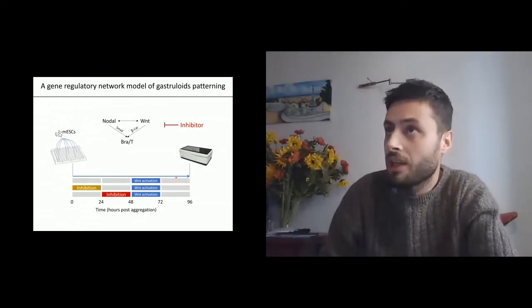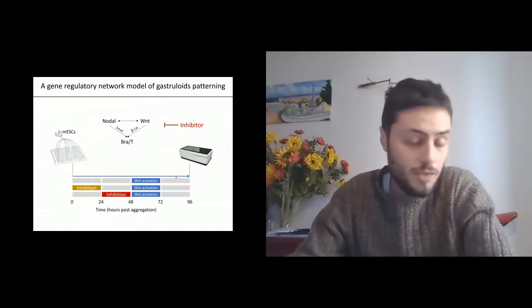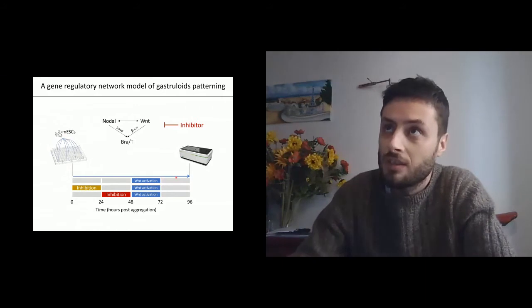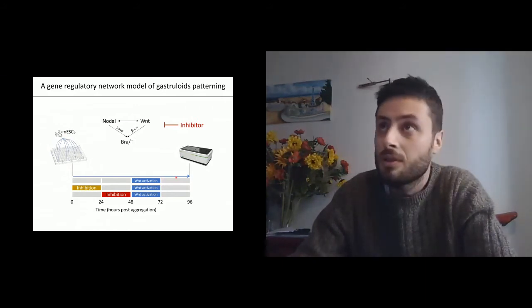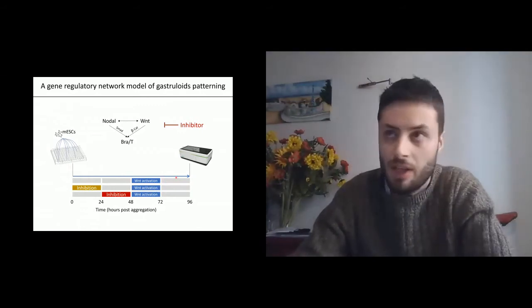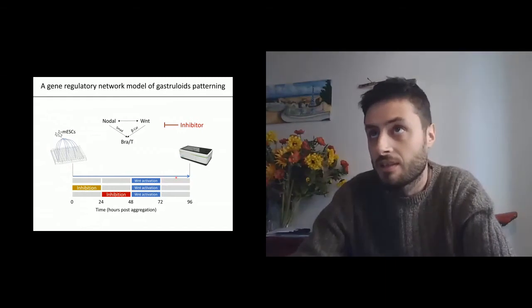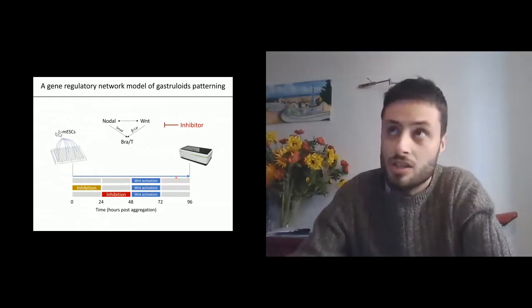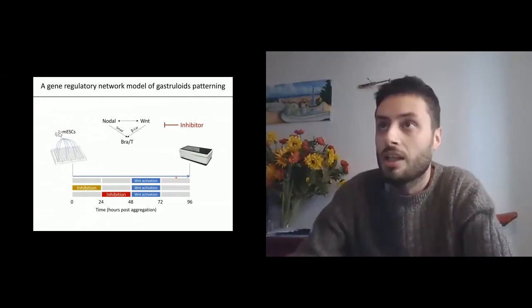So once you put the plate in the system, it is, as I said, everything very automated in the sense that within the software it is possible to define the plate type. So there is a large array of plates available, but it's also possible to customize your specific plate. There are several objectives and magnifications available. It's possible to perform wide field or confocal imaging.